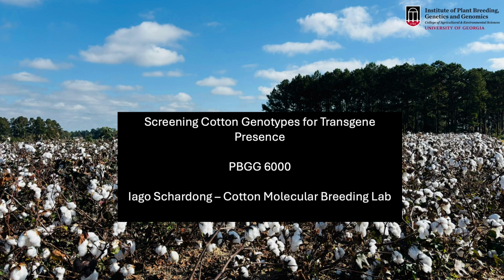I'm a PhD student at the Institute of Plant Breeding Genetics and Genomics at UGA, and today I'm going to show you how we screen cotton genotypes for transgene presence.